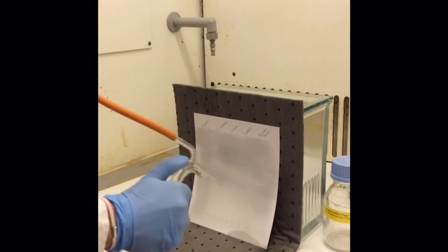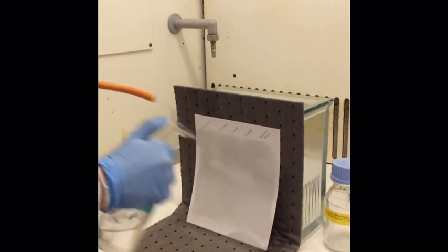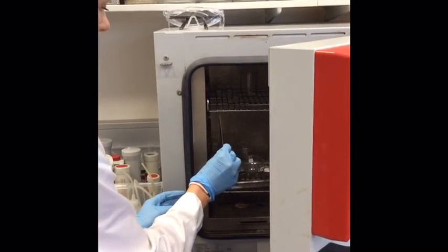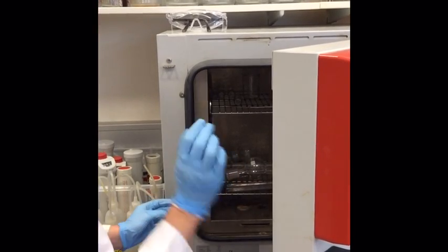Once dry, spray the plate with the visualizing reagent, making sure that the entire plate is covered. Then place the TLC plate in the oven for five to ten minutes.